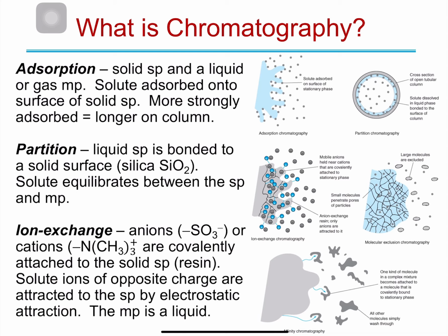So you would think that for partition, it's mostly going to be a liquid mobile phase, because then your substance will be distributed between these two liquid phases. So it's more like the liquid-liquid extraction.